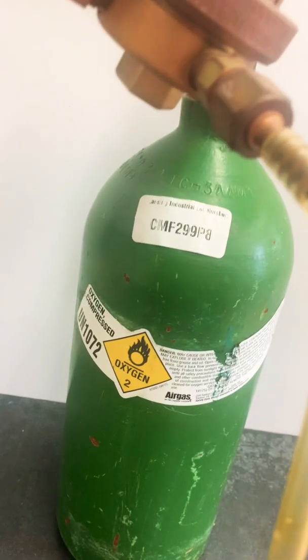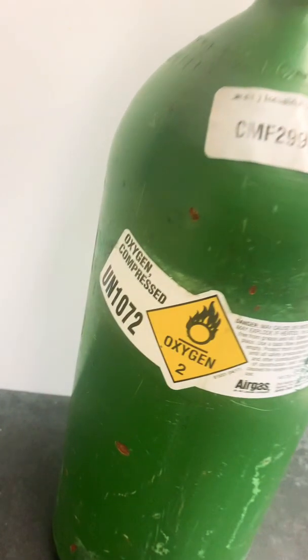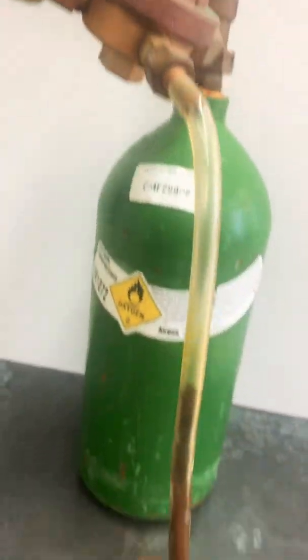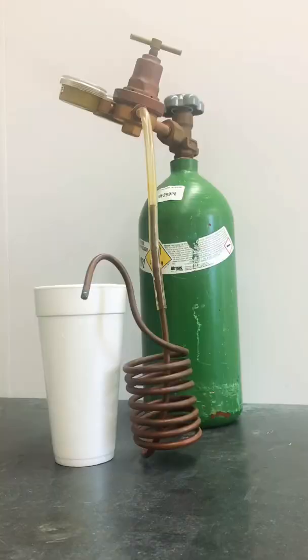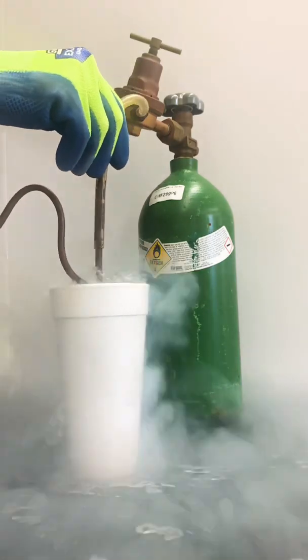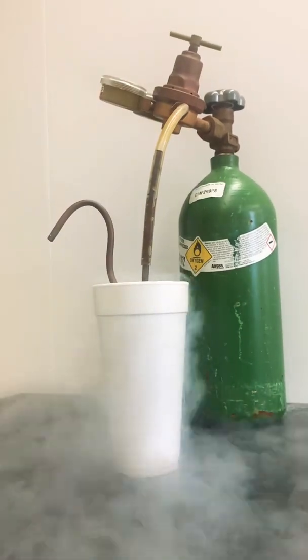This tank contains some oxygen gas. I wanted to try to condense some of this oxygen gas into a liquid and use the liquid oxygen for some experiments. To do this, I'll allow the oxygen gas to flow through this tube and copper coil. However, the copper coil is going to be immersed in some liquid nitrogen, which is minus 196 degrees Celsius or negative 321 degrees Fahrenheit.